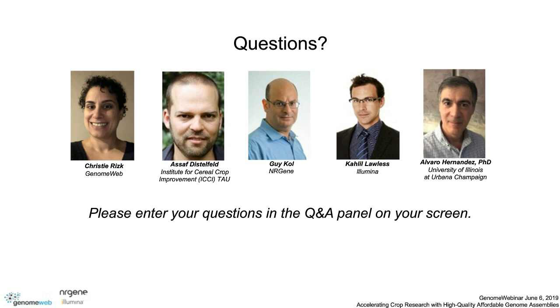Okay, great. Alvaro, I think this might be for you. If someone is interested in discovering SNPs, what library preparation approach would you recommend for a genome with 80% repeated sequences? Or perhaps Asaf, you might be interested in answering this one. Or even Guy would be a good person to answer that. I think for SNPs, if there is a good reference genome, I would definitely do shotgun libraries. And probably overlapping PCR-free libraries would be a good one to do. But if you have a lot of samples, then libraries with a little bit of PCR amplification would make it easier to do multiplexing of libraries. But in my opinion, it would be shotgun libraries if there is a good reference genome. I agree.